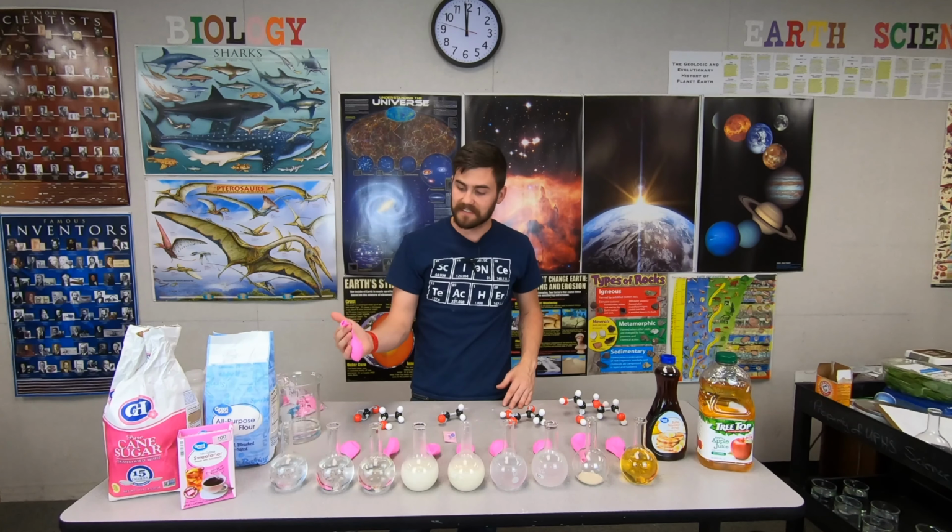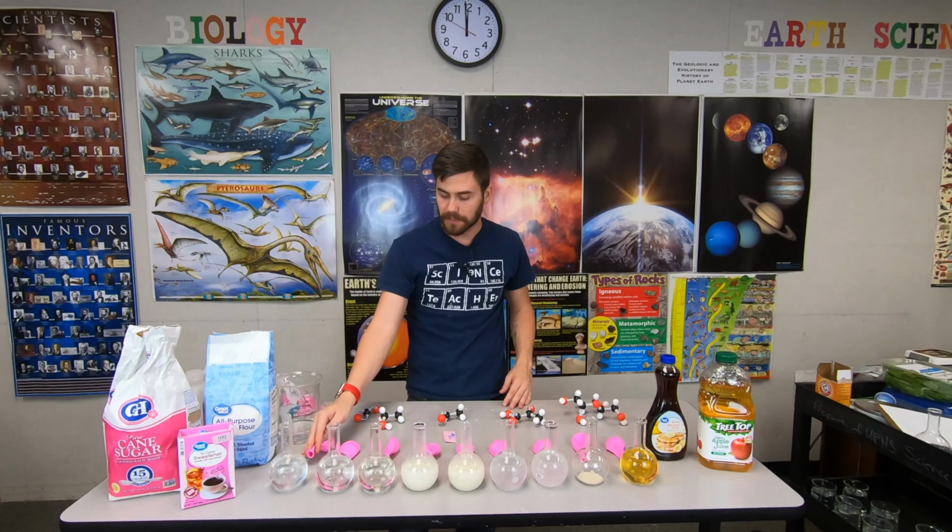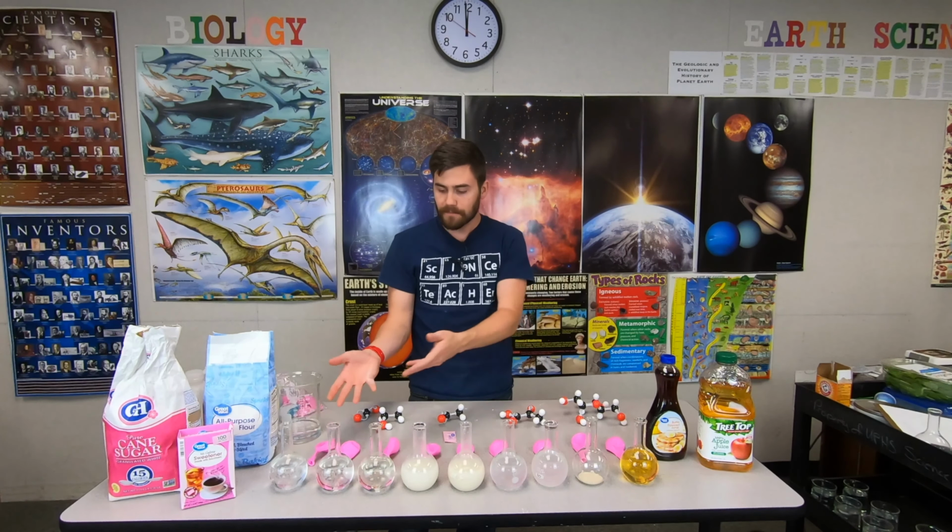But the next step is to cover each flask with the balloon, and then we'll tip each balloon up so that the yeast gets added to these approximately all at the same time. The syrup one will be a little bit different, but that's a very different kind of setup. So I'm going to do that one last.